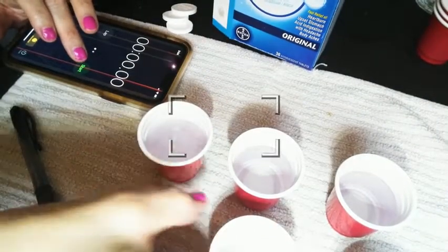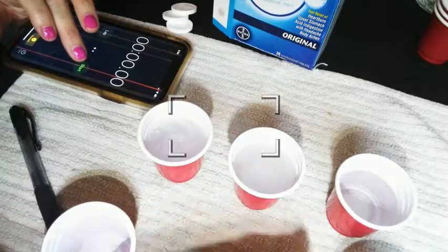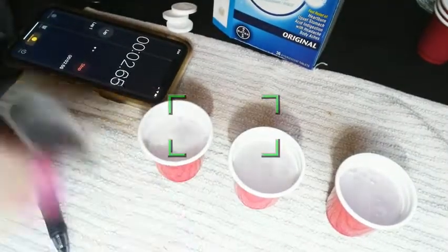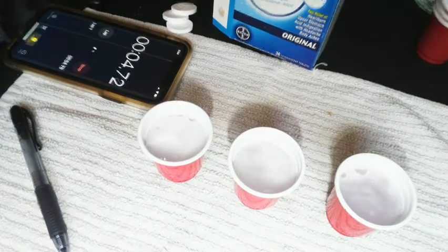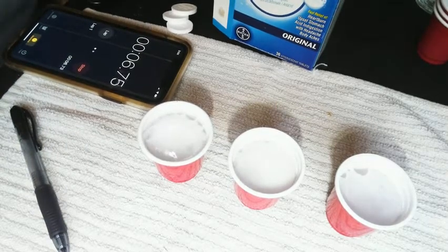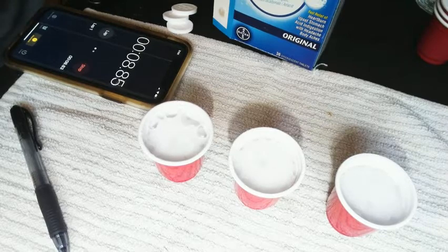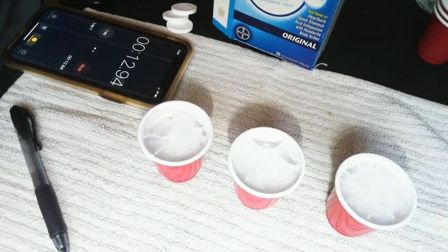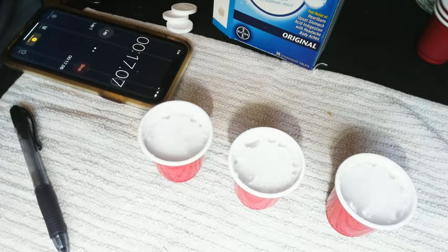I get those all poured in real quick. I know there's a delay here, but again, you're not just noting how much time has passed. I also want you to note the vigor of the reaction, because that's something that you're going to write down as your qualitative data, like what you notice about this.